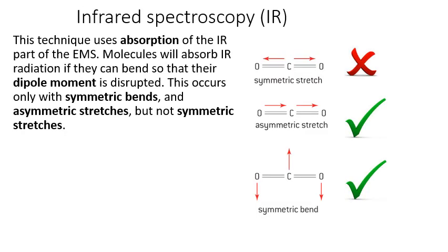Unlike ultraviolet and visible radiation, infrared radiation does not have sufficient energy to result in electronic transitions, but can cause molecular vibrations, which result from the vibration of certain groups of molecules about their bonds. Hence, using this type of spectroscopy, various functional groups can be identified in a molecule. The vibrational transitions correspond to definite and definitive energy levels. And the basis of IR spectroscopy is the spring model, which we will look at in the next slide.